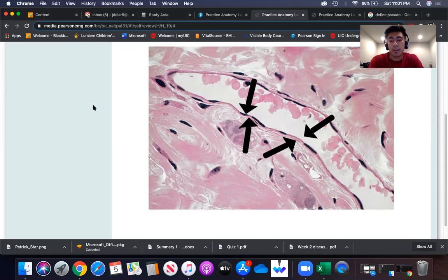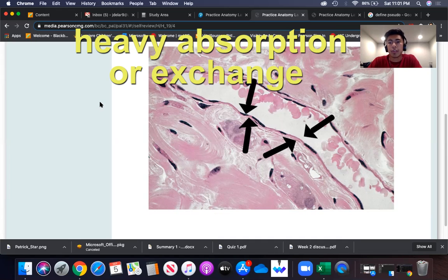If you look here, this very border of this venule is very, very tiny cells. This allows for red blood cells to release all their oxygen, all their nutrients into this tissue, and for all the tissue to release all its waste back into the blood to filtrate. Key point is to know that these cells are extremely thin for that transmission and absorption.